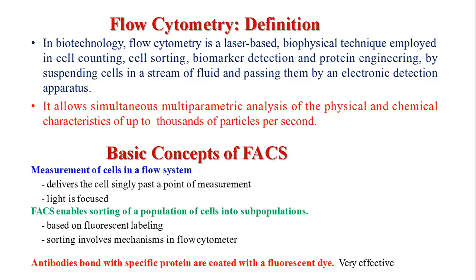And the light is focused. So the cell is in motion. So within the instant of time, what is the condition of the cell? So we can measure it.